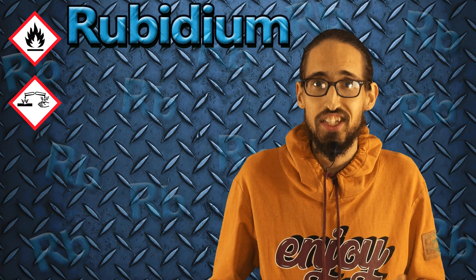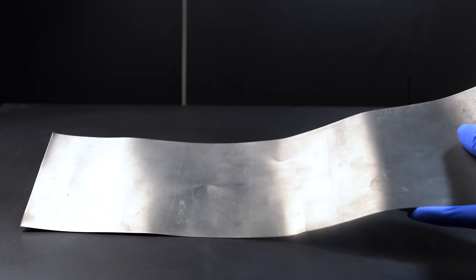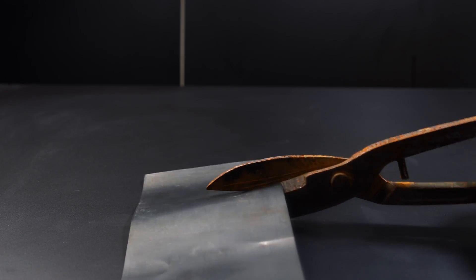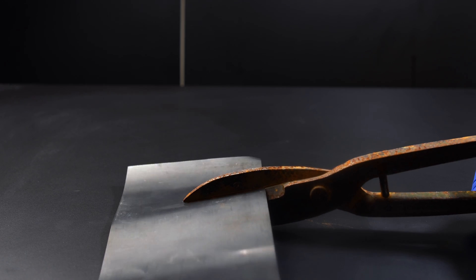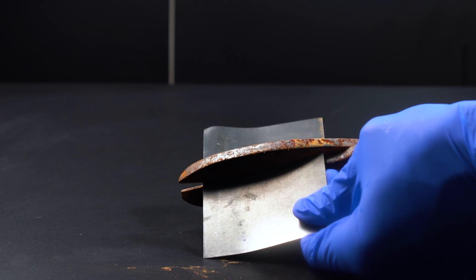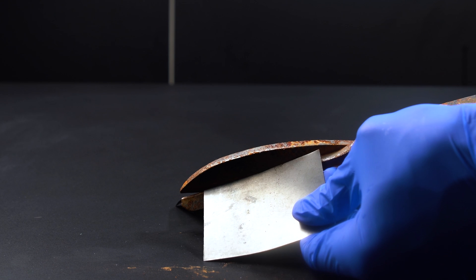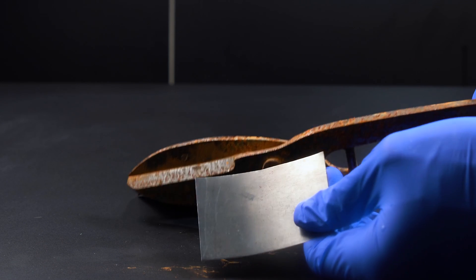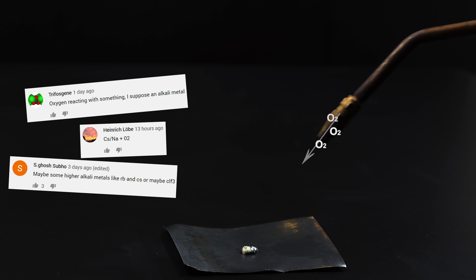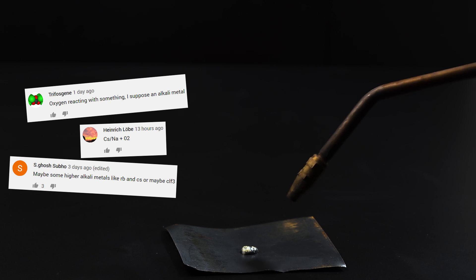Anyway, let's move on to fascinating reactions with rubidium. For this rubidium and oxygen reaction, I will use a tantalum sheet the way I used zirconium foil earlier. I'm going to run a jet of oxygen through a piece of metal rubidium to see if it ignites.